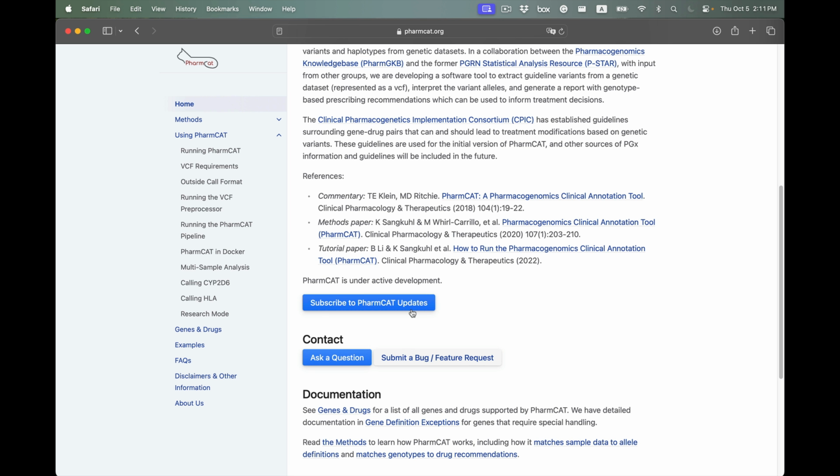This concludes the introductory overview of PharmCAT. More videos will be rolled out in the near future. For example, topics on outside calls from other PGx calling tools, multi-sample VCF files, and advanced functionalities in PharmCAT.